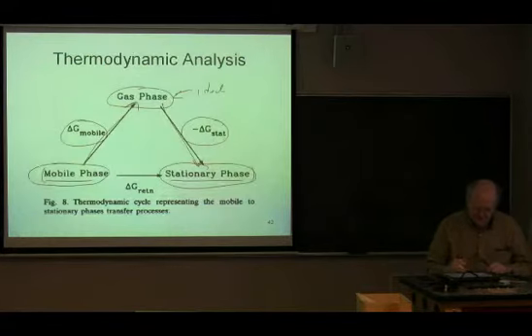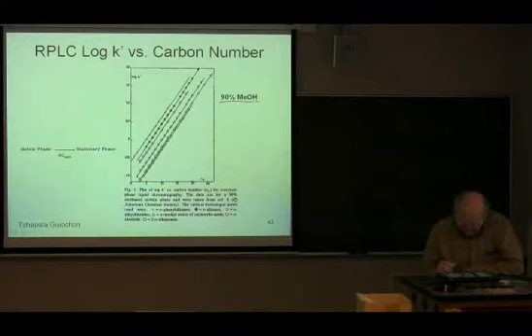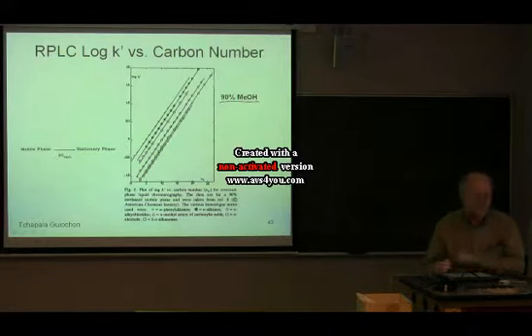We can measure this process simply by doing real reverse phase chromatography. And it's been done to death. Here's a whole bunch of data in 90% methanol, 10% water into C18 phases for a series of phenylalkanes, alkanes, alkyl chlorides, methyl esters of carboxylic acids, alcohols, and N-alkanones.